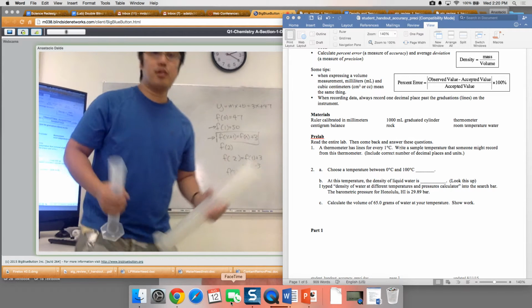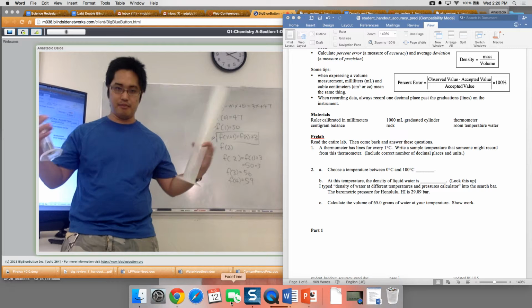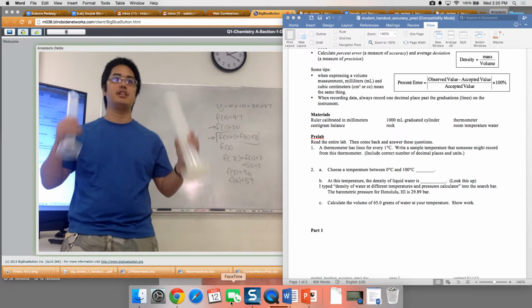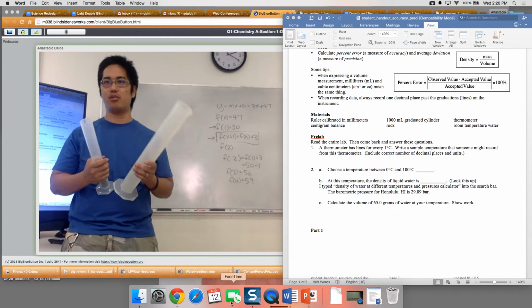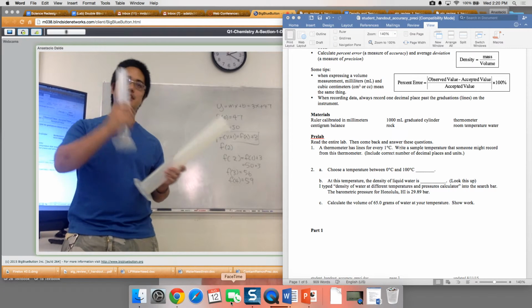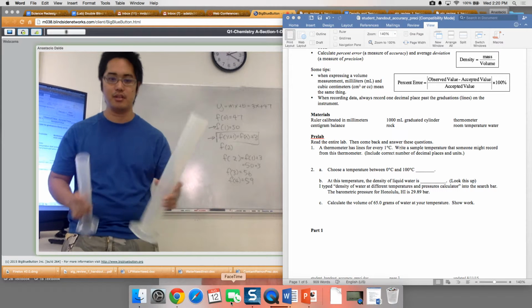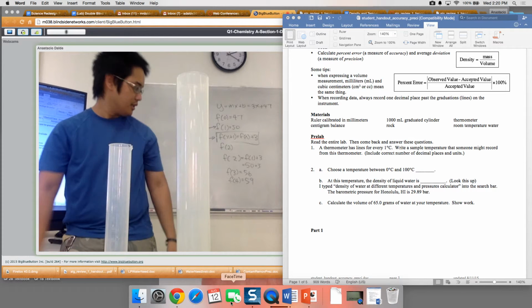I will try to do more explosive labs with you, I promise. And hopefully we can do stuff where we mix chemicals and do some titration, and work with even hydrochloric acid, which will burn a hole through your hand if you're not careful. But until we get there, I need you to be careful with these things, and I need you to learn how to correctly use chemistry equipment.